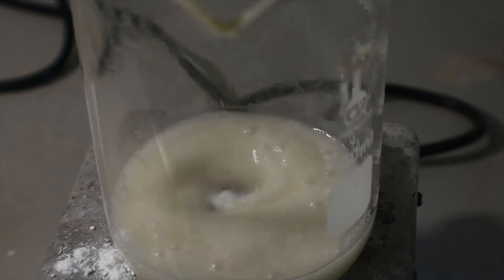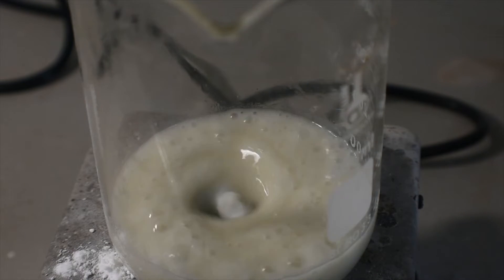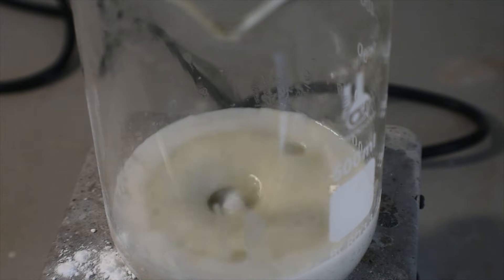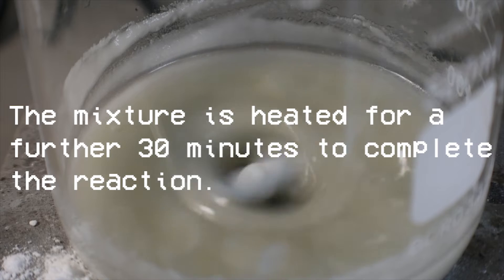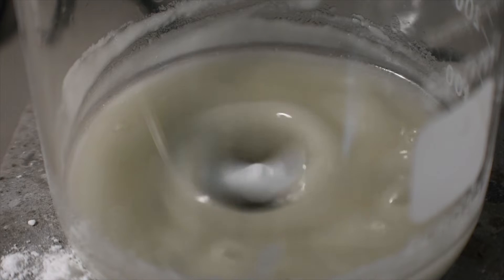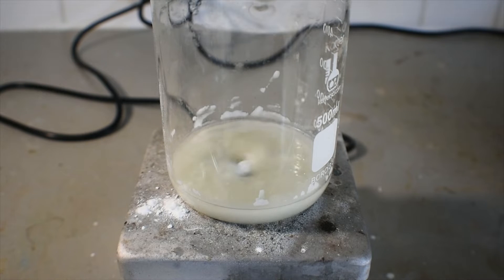I'm actually going to get a respirator on because this is putting out a little bit of mist. Next, 150 ml of boiling distilled water is added to the mixture, in which the potassium sulfate produced in the reaction will dissolve.